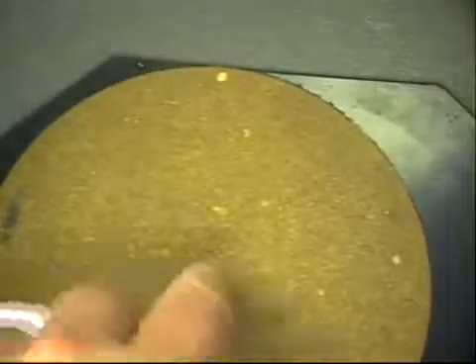You can see now that they're white specks, or light colored. What has happened is the wax has, in the process of making the hand sheet, drying it on a hand sheet dryer, the wax has now melted and come into the liner board or into the OCC and made the fibers waterproof. With the water, it has turned all of the unaffected fiber dark, but it has remained lighter colored areas where the stickies are present.